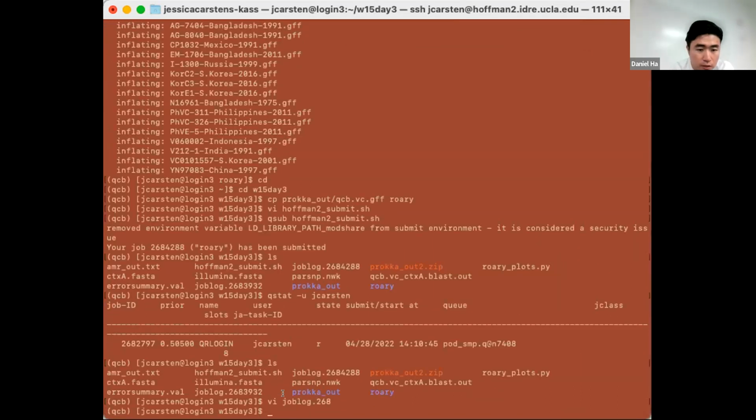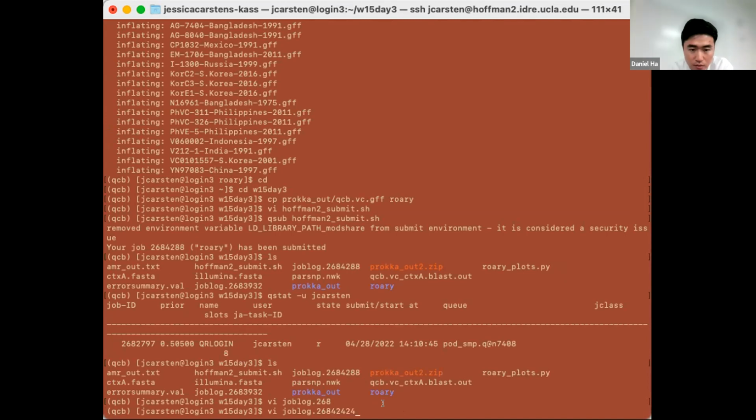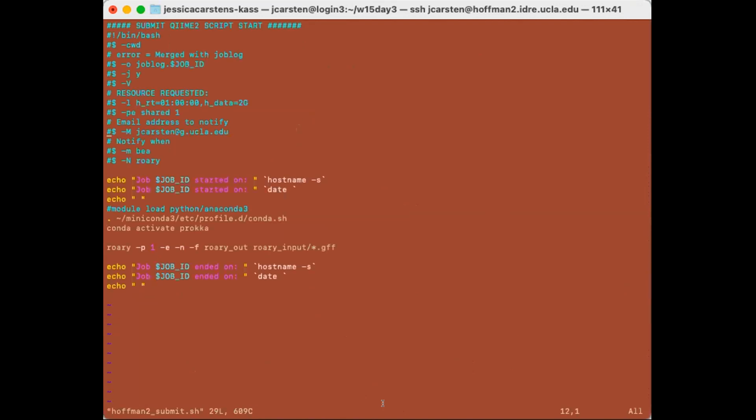Sorry. It ends in 4288, right? Yeah. Oh, Rory not found. That's why it completed so fast. Mine is still stuck in queue.